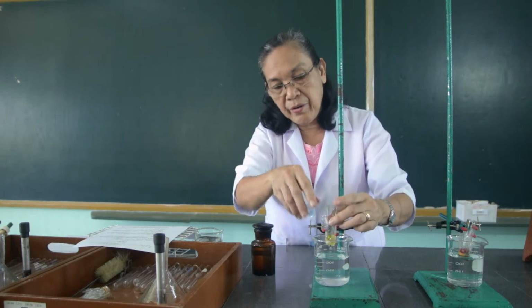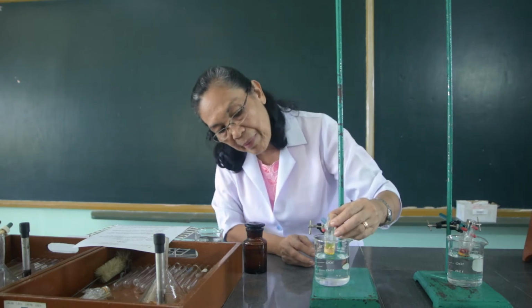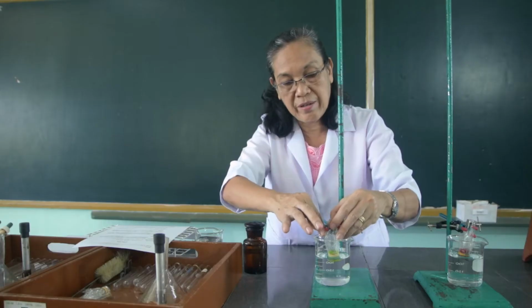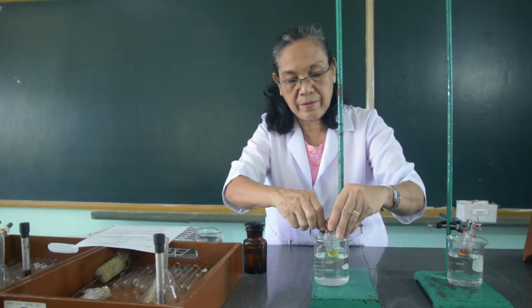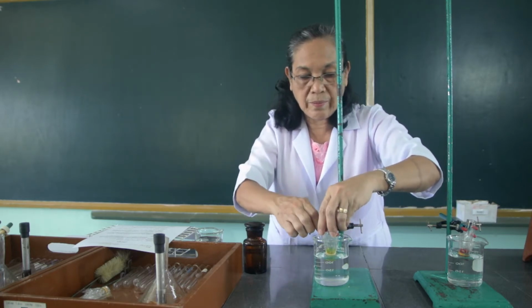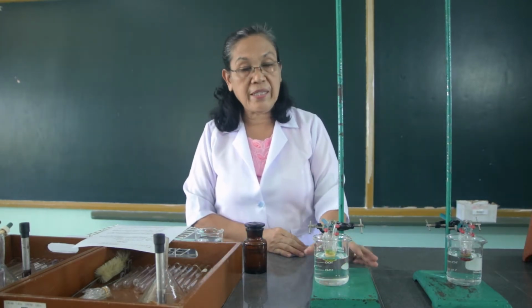In like manner, we are going to submerge this also, such that the bottom part of the dialysis tube just touches the surface of the water inside the beaker. And we will observe these setups after 20 minutes. So let's put this aside for a while.